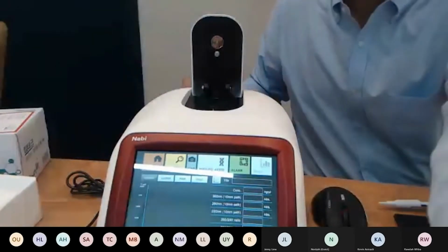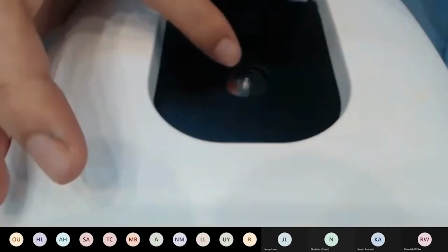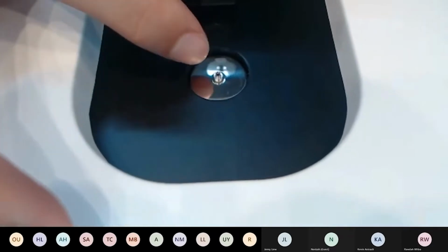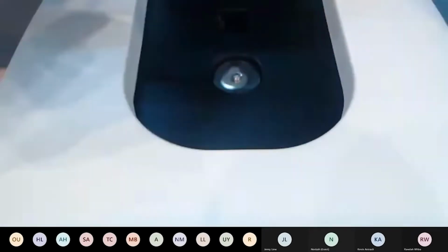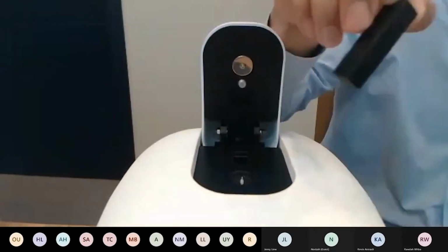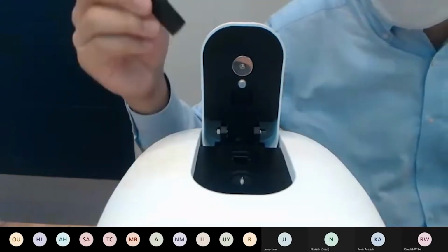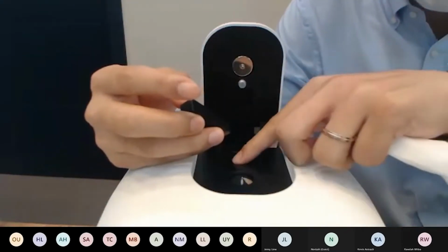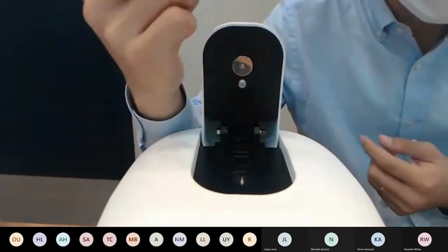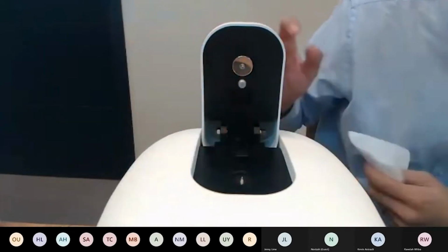So if you'd like to take a look, there's the little pedestal that we use, and I'm not sure you can see it that well, but there's the little bubble of buffer on top of it. And this, which I forgot to mention, is what we call a cuvette stick. So when you're measuring micro volume, because the results may differ because of the cuvette measurements going on at the same time, you just need this thing to cover the block. And this is obviously provided with the instrument.